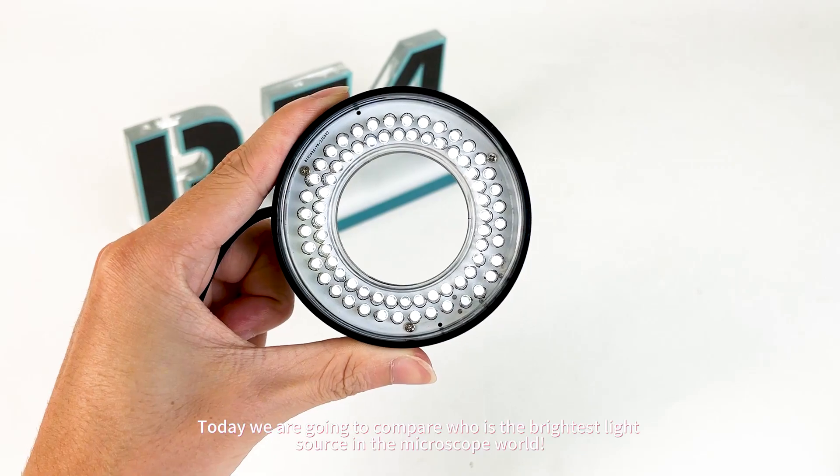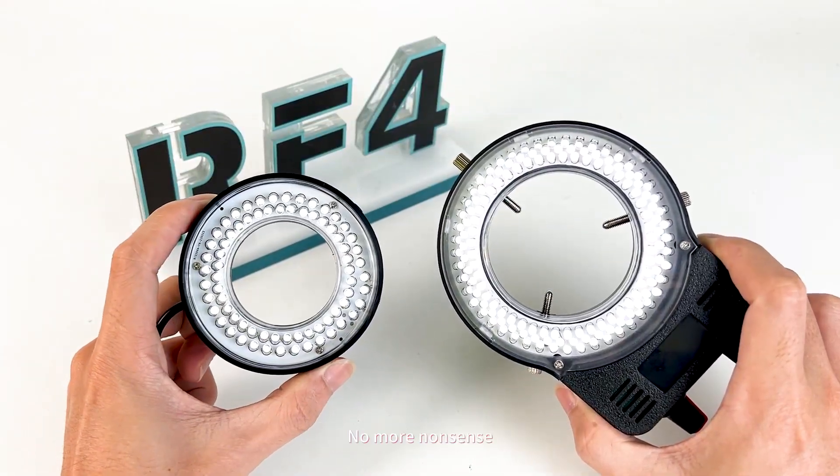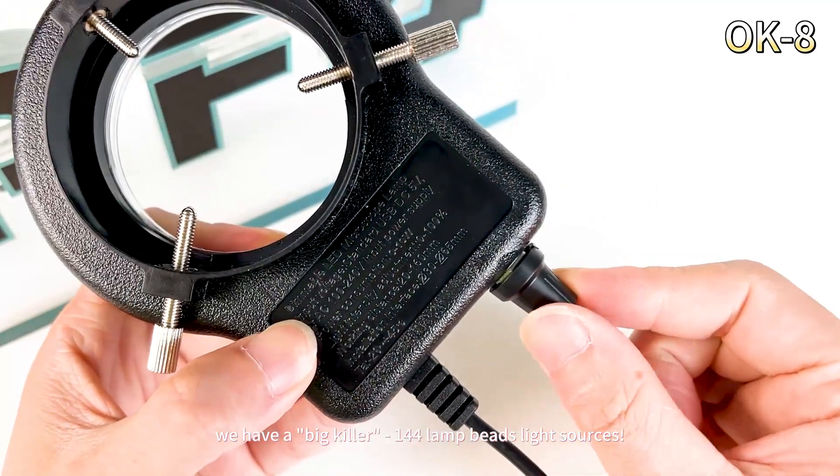Hey everyone, today we are going to compare who is the brightest light source in the microscope world. Let's make a comparison right away. First of all, we have a big contender: the 144 lamp bead light source.